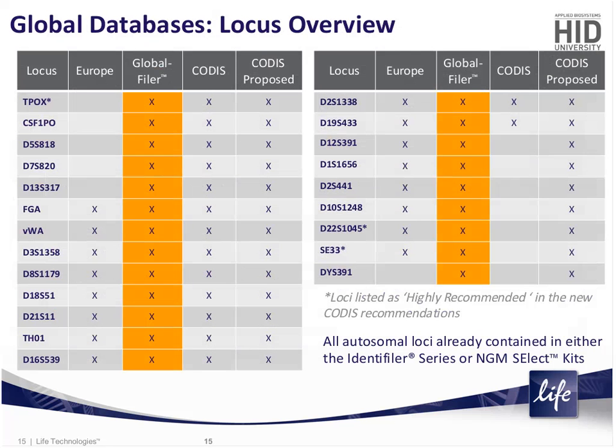The next challenge is to incorporate all of the loci which are on the databases internationally. And this is just an overview of some of the loci in common use internationally on those DNA databases. And you can see it's now a very long list of loci. And really the core goal is if we can incorporate all of the loci on the new CODIS proposals, we will incorporate the majority of the other locus sets internationally, because the CODIS recommendations reflect the advances in locus set decisions that have been taken by other international jurisdictions over the last few years.